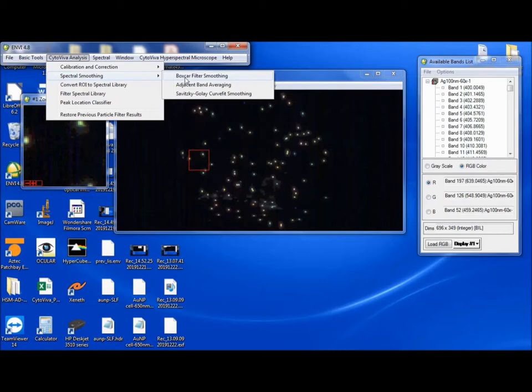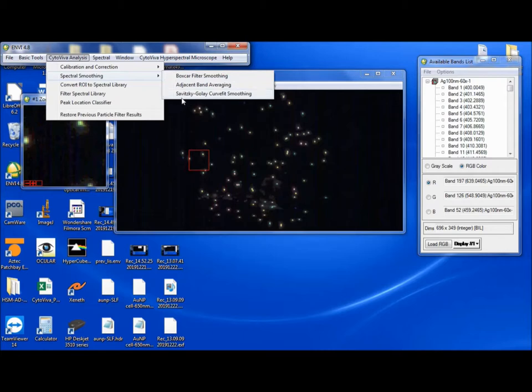There's boxcar filtering, adjacent band averaging, and Savitsky-Golay curve fitting. All three of these essentially do the same thing. They smooth out the spectrum. So if there's noise in it or you just want to see a more smooth spectrum, you can apply one of these three smoothing tools.